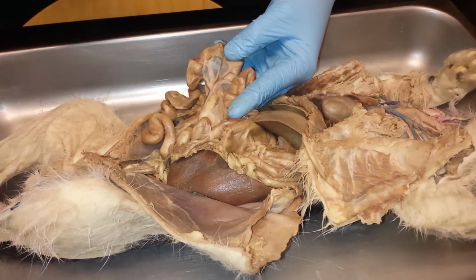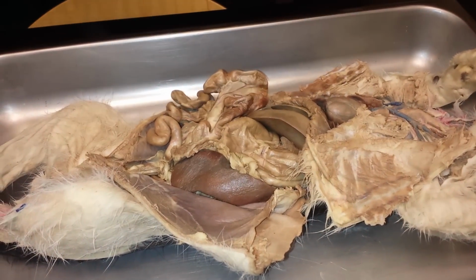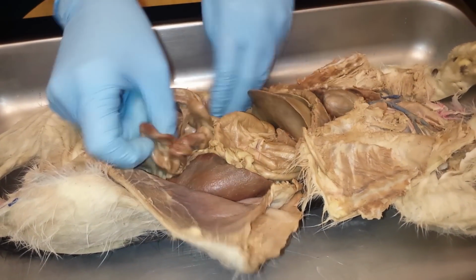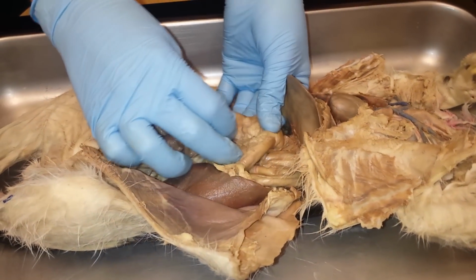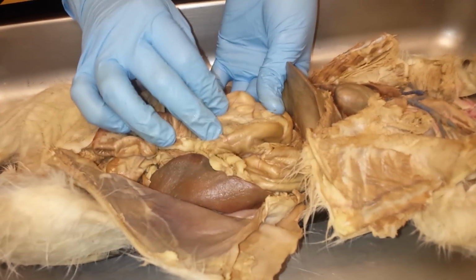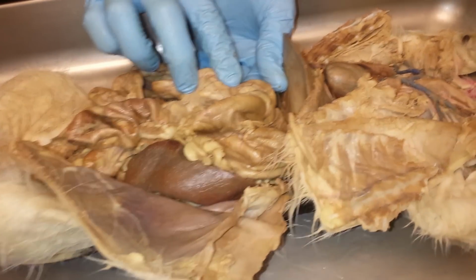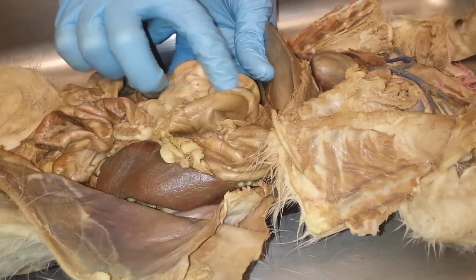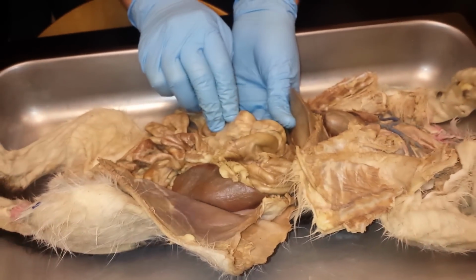It's what helps hold and give a little bit of structure to all of the intestines. Because the intestines are so long, you can't just have them flopping around, so it helps keep them more structured. But embedded in the mesentery, right below the duodenum, there's this very grainy organ, okay? That's the pancreas, right? So the pancreas is embedded in the mesentery right below the duodenum.